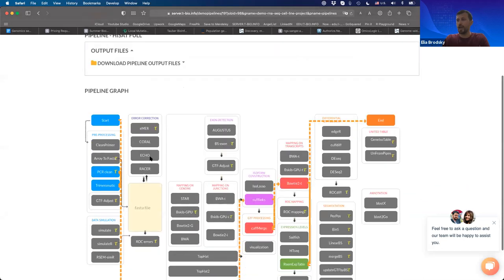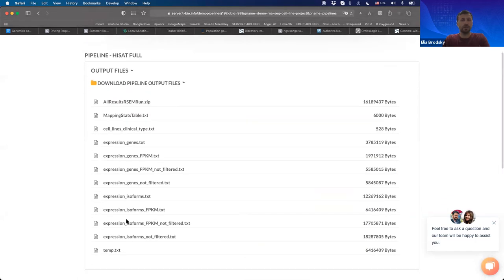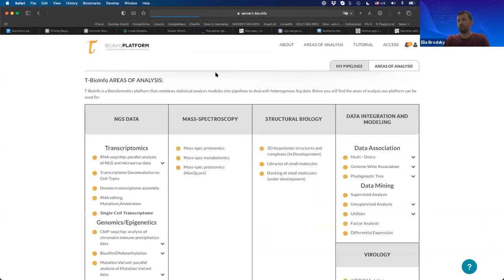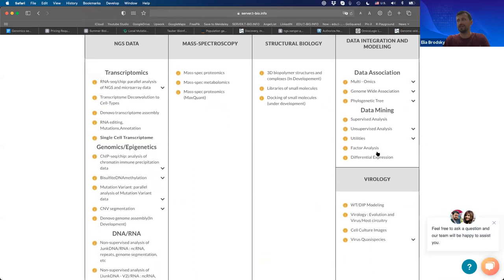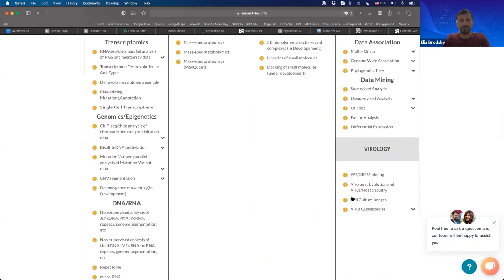You can download pipeline output files to see what those outputs look like. Once you get the table of expression — the major output — you'll be able to access a variety of data integration, data mining, and specific virology applications for these datasets, including supervised analysis, unsupervised analysis, biological interpretation utilities, and virology-specific applications.